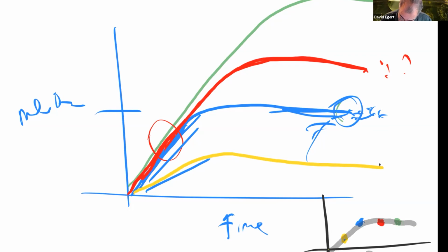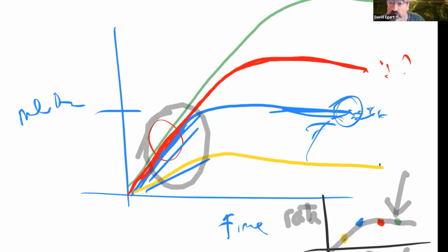Again, this is concentration versus rate. The rate isn't getting faster, but it doesn't mean that the reaction isn't going. The reaction's going crazy. And I know people get confused here. That's why I'm going over it again and again. I do understand that it can get tricky to keep this all straight. So are there questions about that?